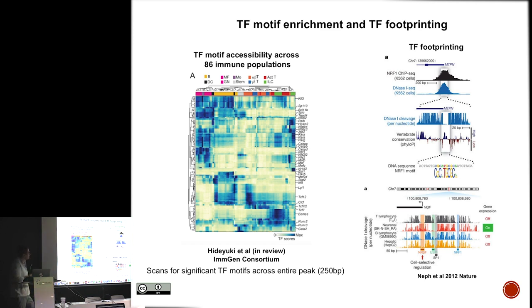that follows that really nicely. Now, computationally, instead of mapping the entire read, if you only map the first nucleotide position of that read, what you'll get is individual base pair coverage. The reason why this is interesting is that if you can imagine my arm is DNA, when the protein binds to the DNA and you add the DNase, you'll get cutting on the ends on the opposite sides of where the protein is bound. But you protect the sequence where the DNase cannot insert itself or cannot cut. And these actually form these nice little indentations which are resolved as footprints.